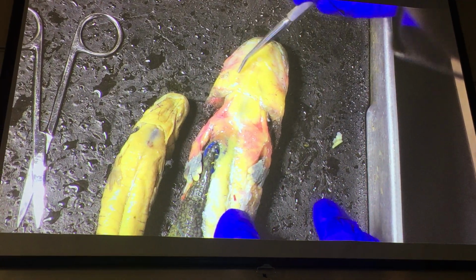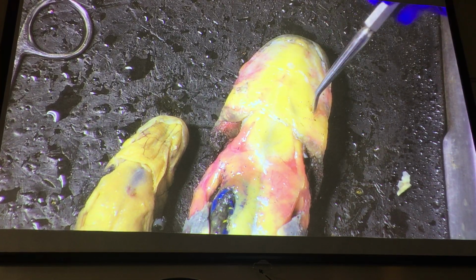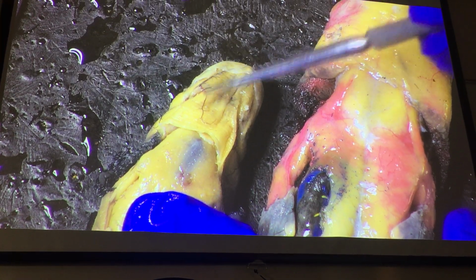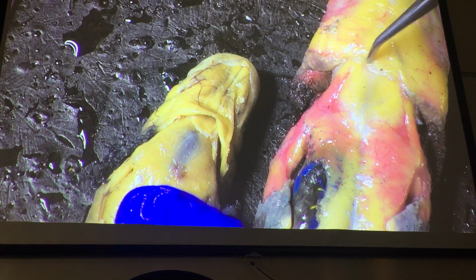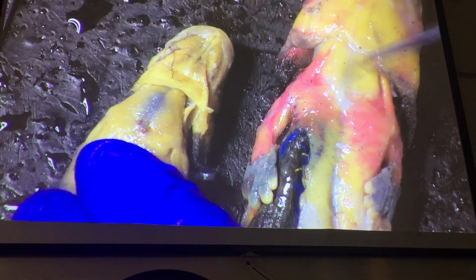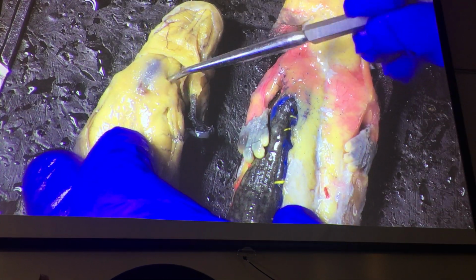So we have two muscles here and here. We have the intermandibularis and the interhyoideus. And they're a little easier to see here, I think, even though they're hard to separate because, again, the fascicles have nice borders here that show up a bit better. But there's your intermandibularis, your interhyoideus. This gular fold is actually lower than it is on your mud puppy, which is going to influence some of the muscles you'll be trying to see here. In fact, got a little bit of skin under there too. So it's going to affect some of the things like this muscle here, the procoracohumerus is going to go under the gular fold, making it a little harder for you to follow.